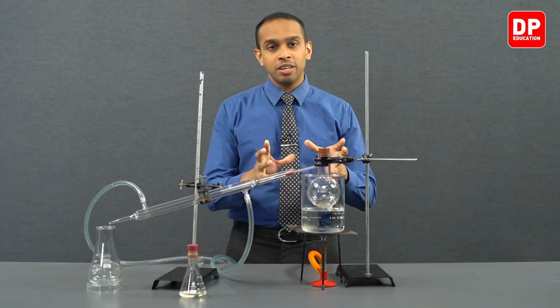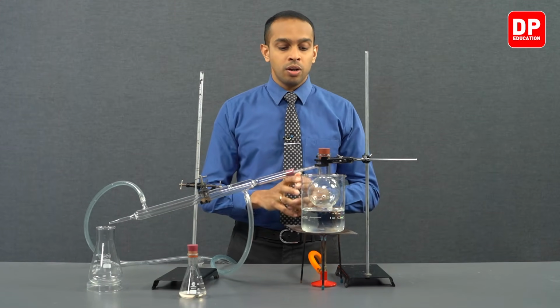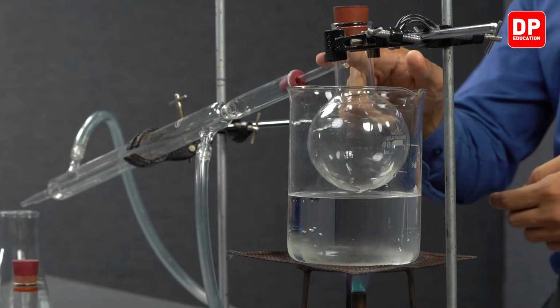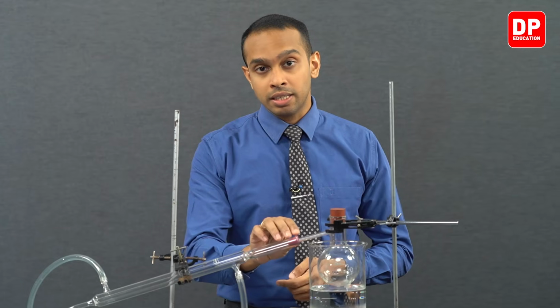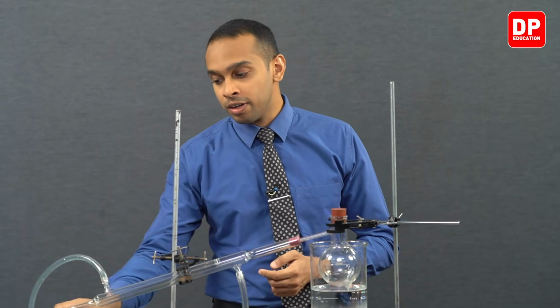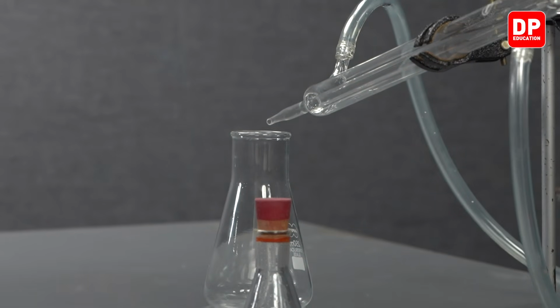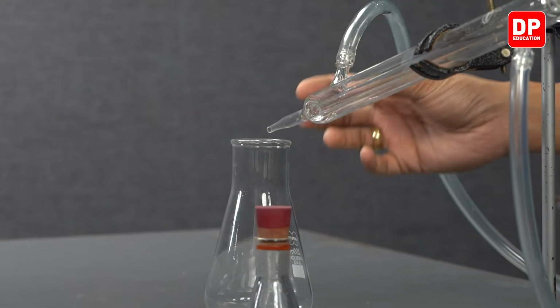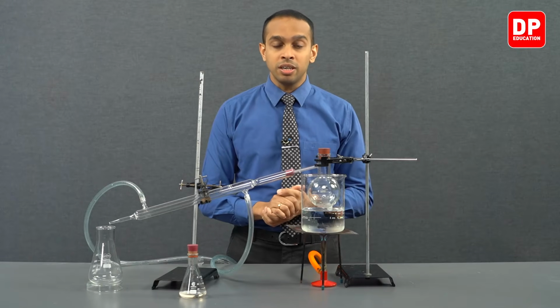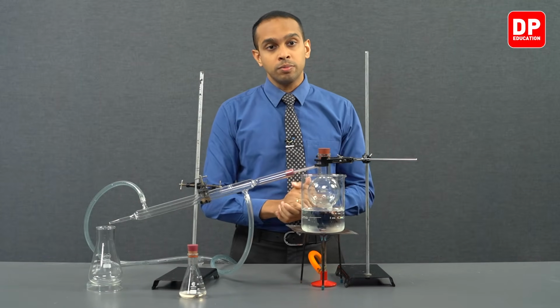Now students, we have a distillation setup that is fixed in front of us. We can see we have fixed a distilling flask, connected it to a Liebig condenser here, and at the end of the Liebig condenser we have a conical flask that is set up to collect a fraction of the liquid that is separated from this mixture of liquids we will have in this round bottom flask.